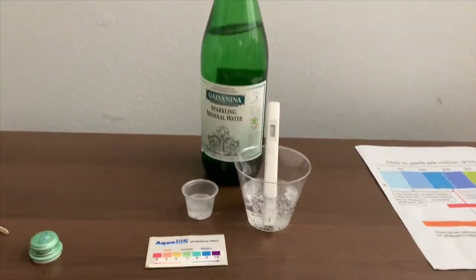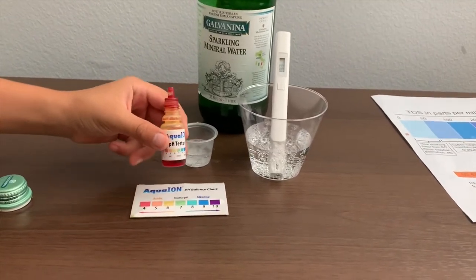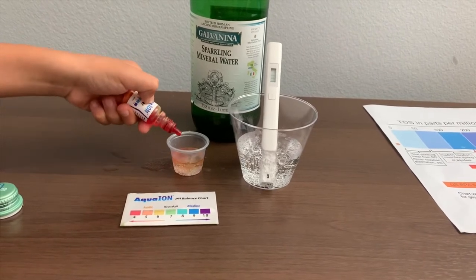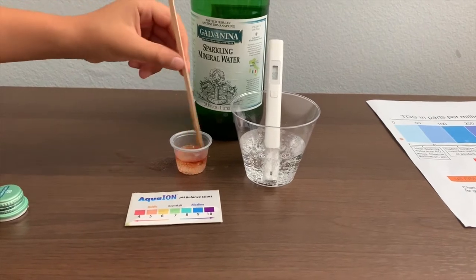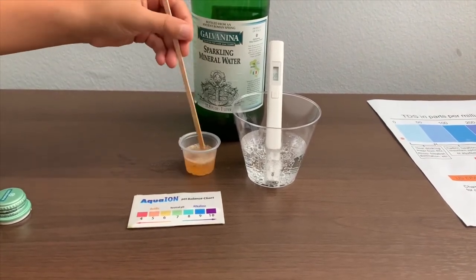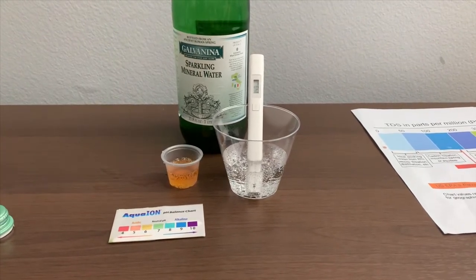Now let's test the pH level. If you want to buy this pH tester, check the link down below. Only do two drops. Let's stir it a little for a better result. I give this a 5, a 5.5. That's acidic.